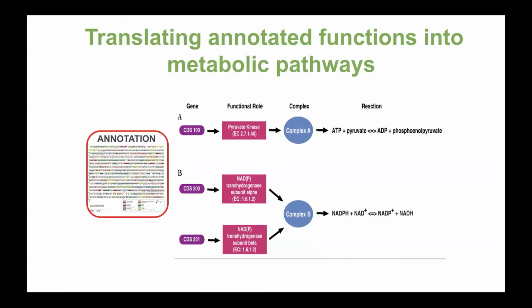The key thing you need to understand is how this model is created. Your model is going to be as good as your genome annotation is. What we do is look at the genome annotation that you submit. We look at the functions assigned to the genes, and then there are reactions mapped to these genes. We have what we call a model reconstruction template, where all of these mappings live. That's kind of the sauce, and it's something you can go look at yourself and edit if you'd like, in our publicly available data repositories.